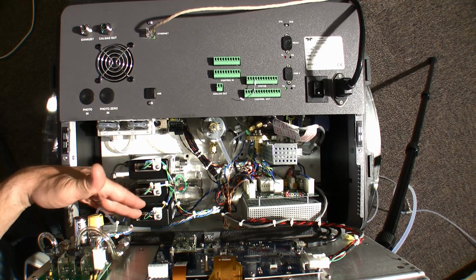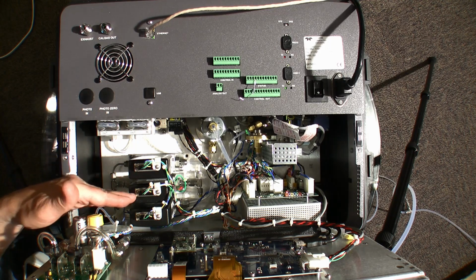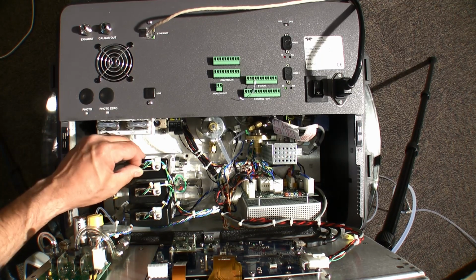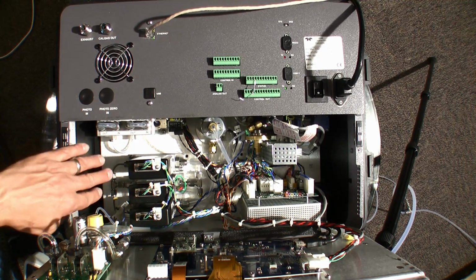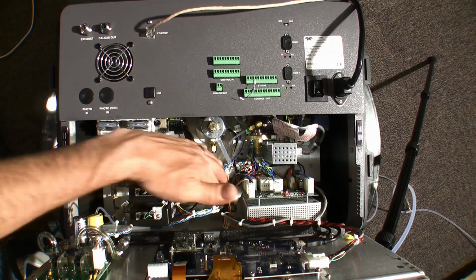So starting in the front is our 20 liter mass flow controller. The next one, I believe, is our 200 cc mass flow controller, and then our 3rd mass flow controller, Cal 2 we call it, in this case is a 20 cc mass flow controller. The flow in this is all from left to right, so our air and gas all come in on the left side here, and they exit on the right side.